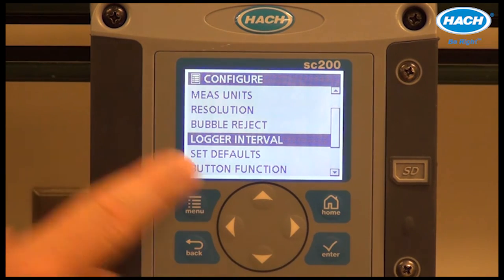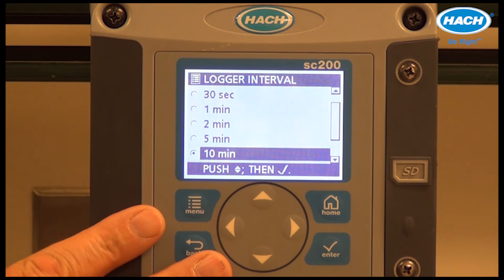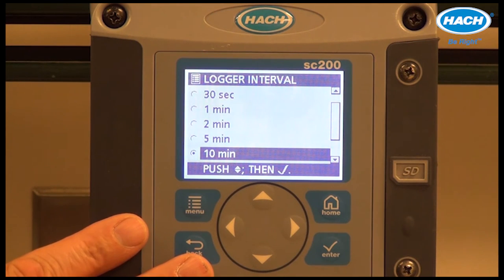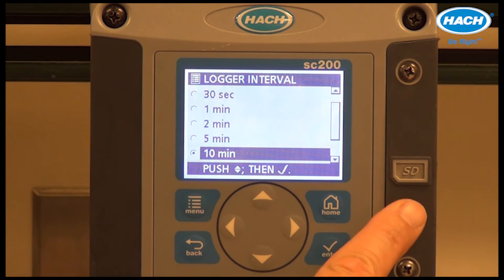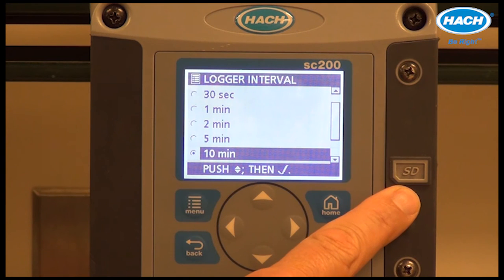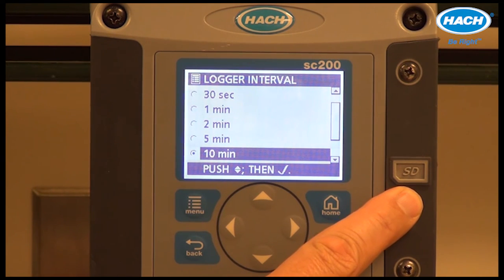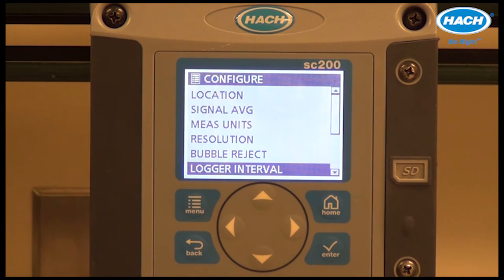The logger interval controls onboard data logging of measurements. The TU5400 can initially store data, and long-term storage is provided by the SC200. The instrument can automatically log data that can be downloaded via an SD card for manipulation, averaging, graphing, report building, etc. The data logging interval can be set in this particular menu.